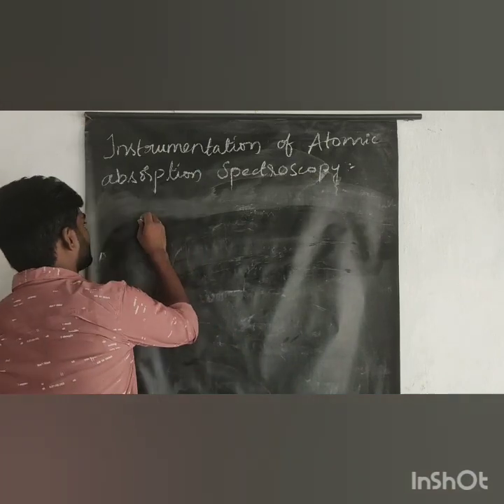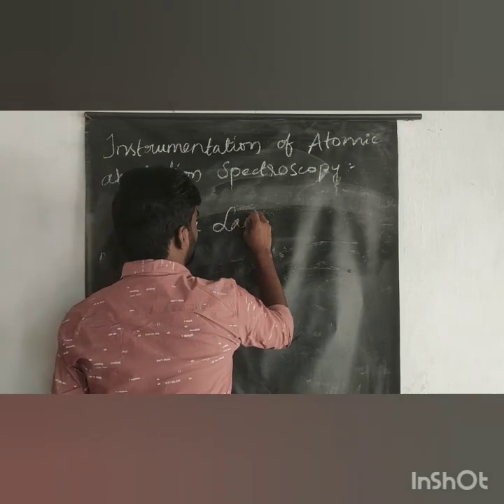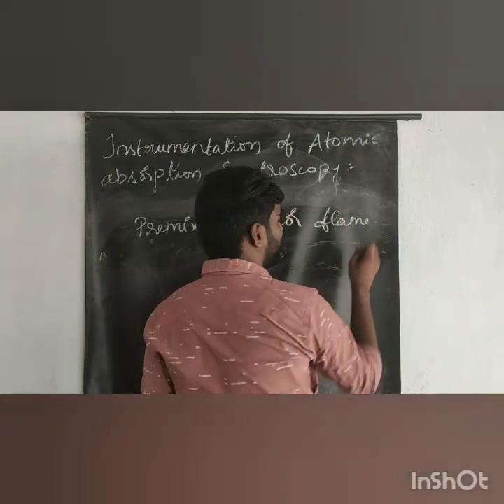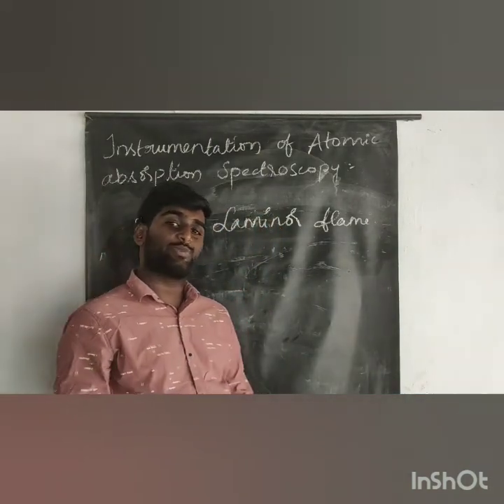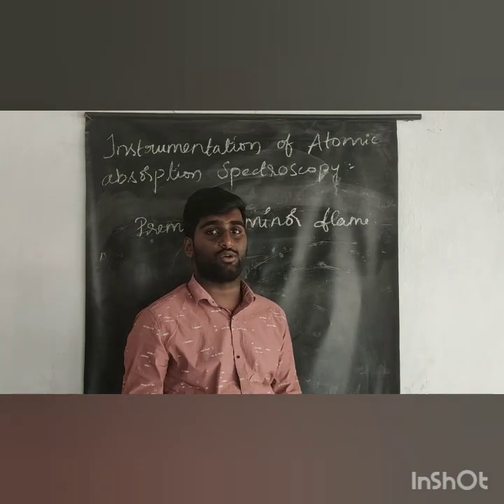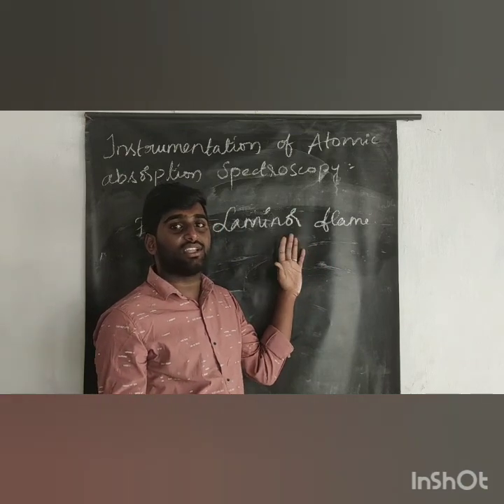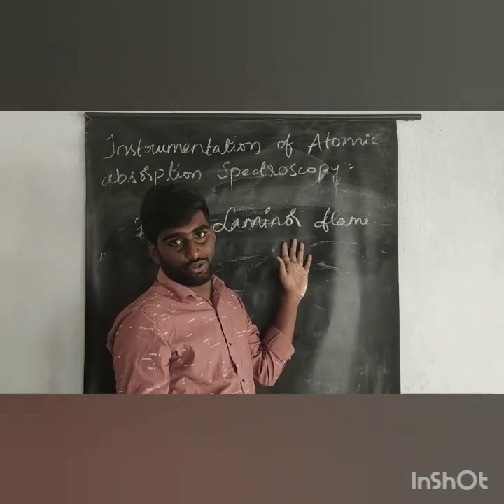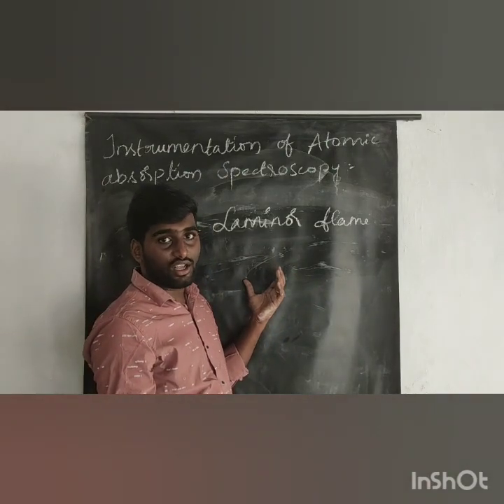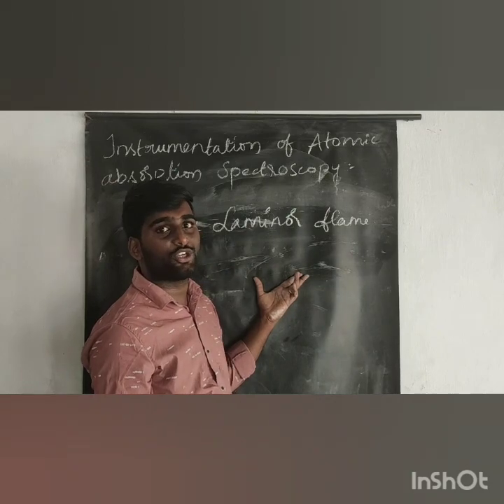Premix laminar flame. Okay, here we have to take the aspirated sample and thoroughly mix it with the fuel and oxidant in the ratio. After mixing the fuel and oxidant in the ratio, the gases move non-turbulent and noiseless.